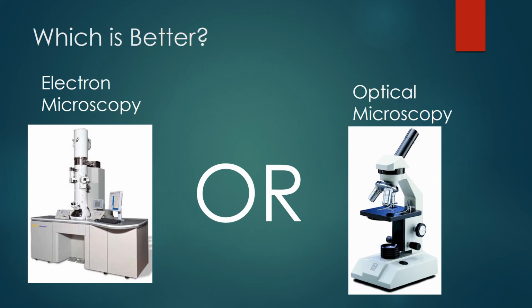Optical microscopy is obsolete now that electron microscopy is readily available. This is because it has made the optical microscope outdated and is much more precise and accurate. The resolutions are much greater than optical microscopes. The magnification difference between the two is outstanding. The fact that the SEM creates a 3D image is very pleasing as well. It also provides detailed images of interior structures of cell organelles. This is proof that optical microscopy is obsolete now that electron microscopy is readily available.